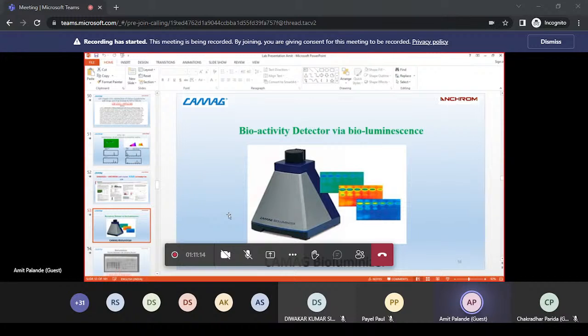Now we'll start with the application areas where HPTLC is mostly used: pharma, food and adulterations, botanicals like herbals, industrial analysis, reverse engineering, organic chemicals, reaction monitoring, and forensics. First we'll start with the pharma applications.